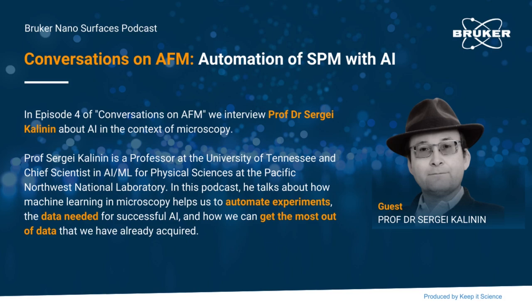That is so insightful. I'm just taking notes and I'm fascinated to listen to you talking about this. Because as you say, there's so much decision making when you're on the microscope, and a lot of it is probably very intrinsic and you just do it by training and habit. So you spoke, for example, about the fact that the AI agent can do longer imaging and also make faster decisions. So I was wondering, do you also think that the AI agent is especially good if, for example, there is a less trained user, or to actually standardize image acquisition on the microscope?